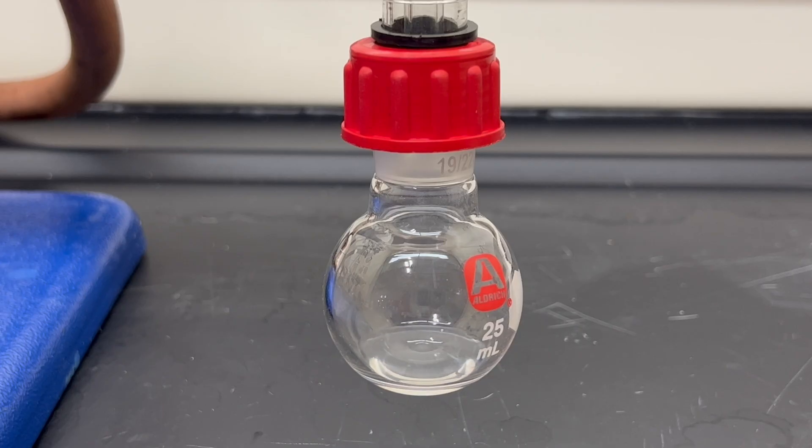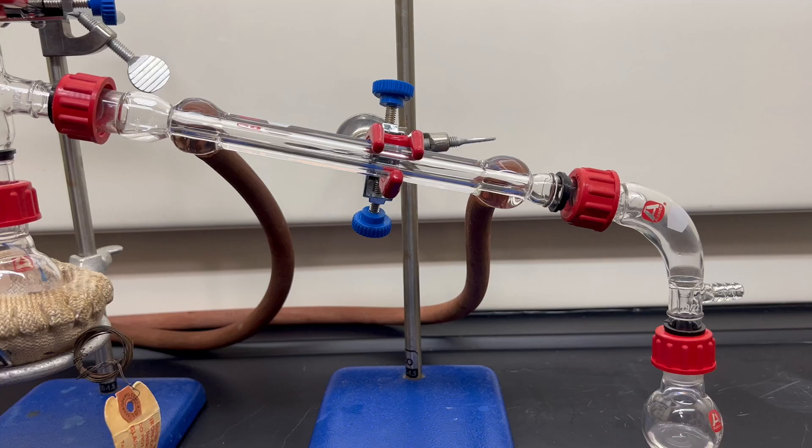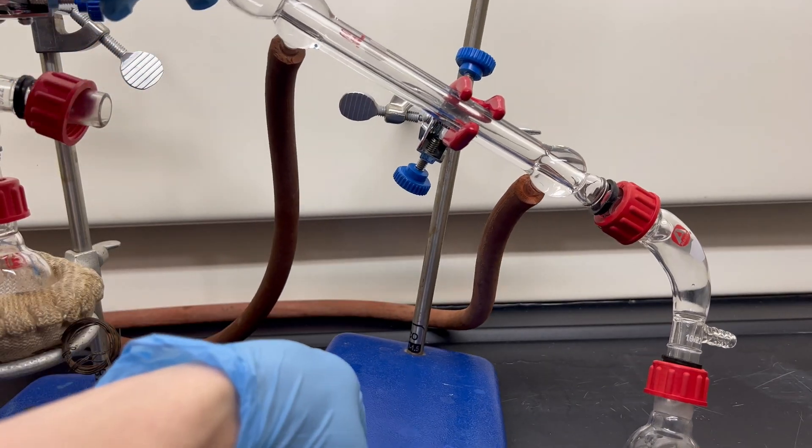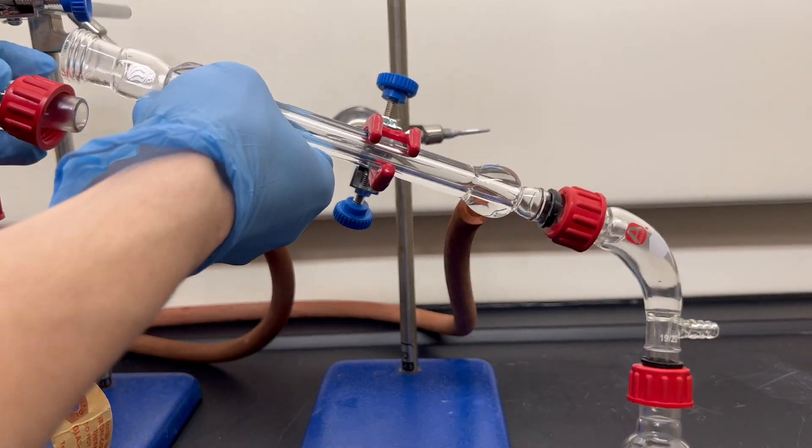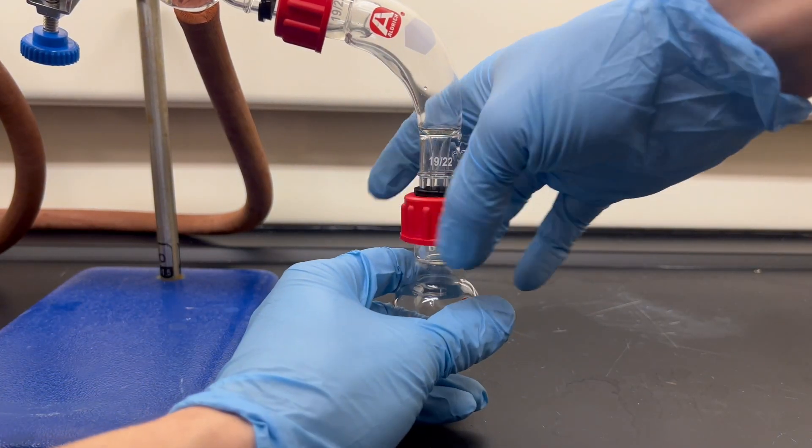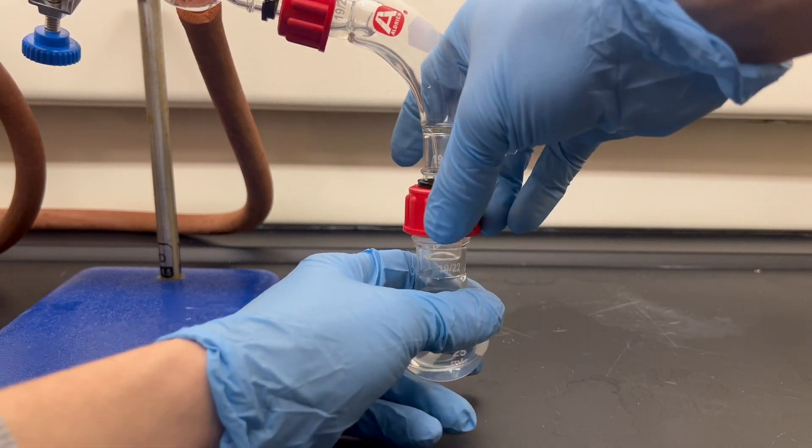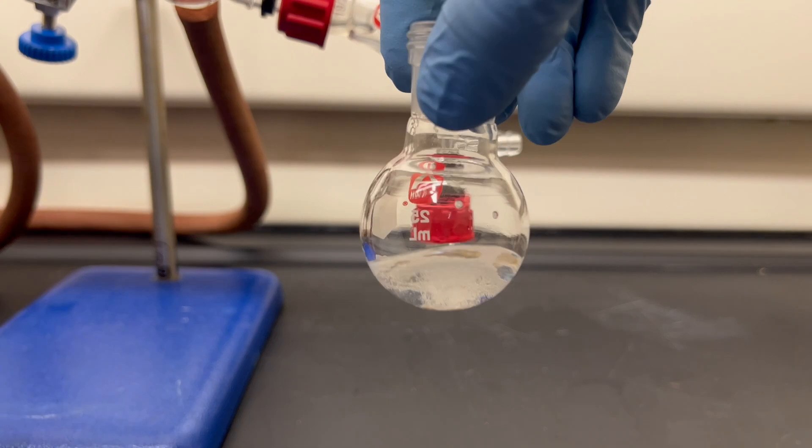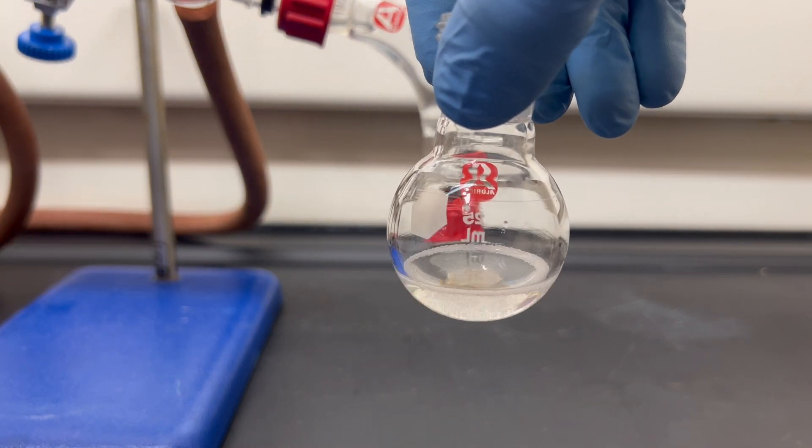The benzene coming over is a bit cloudy. This is most likely due to water as an impurity. The reaction is heated till no more benzene comes over. I then took off the flask and added a few molecular sieves to dry it out. This removed any of the cloudiness that was left over.